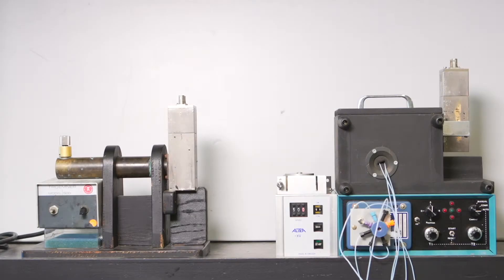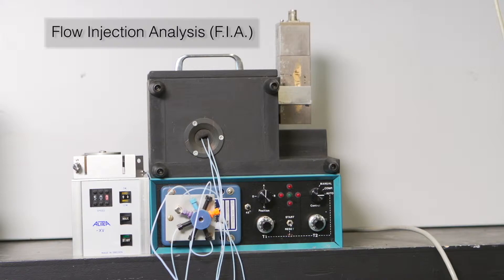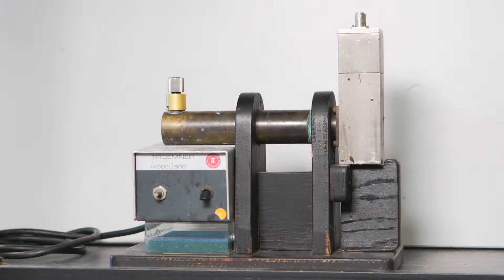This experiment uses two different methods and instrumental setups. This one is the manual injection and this one is the flow injection analysis or FIA. Let's take a look at the manual injection setup first.